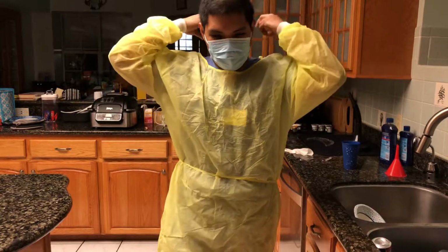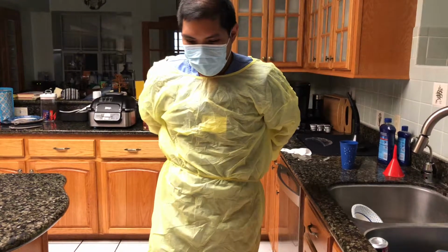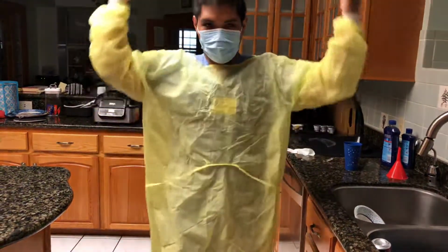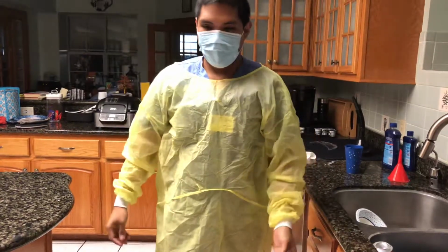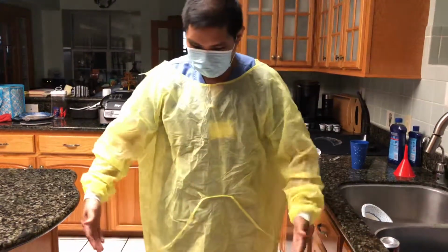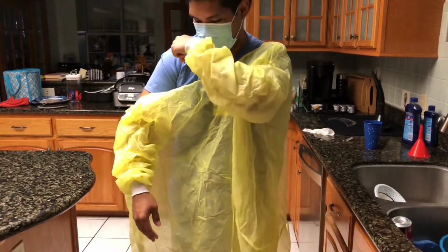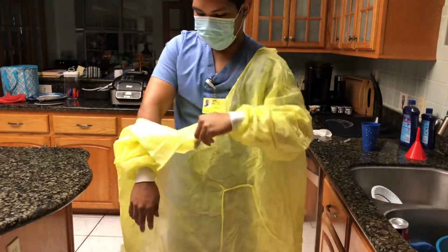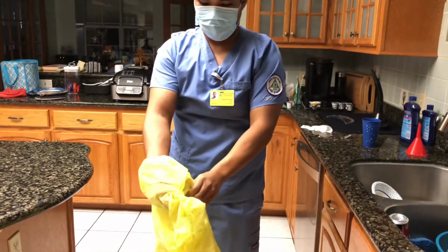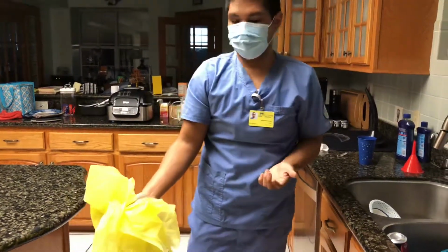Okay, so after that, then you have to take off your gown. You can do this by untying the back. Now my hands are ungloved, so you can touch the back because it should be fairly clean compared to the front. Alright, now untie the back and untie your necktie. At this point mine is broken, so it's already untied. Right now you have to remember this whole front part is contaminated, so make sure you don't touch it. What you can do is wiggle the sleeves down like so. Then grab the top part from the inside only, and take it off like that. Then once you do that, you roll it inside out, like so, and throw it away at an appropriate receptacle.